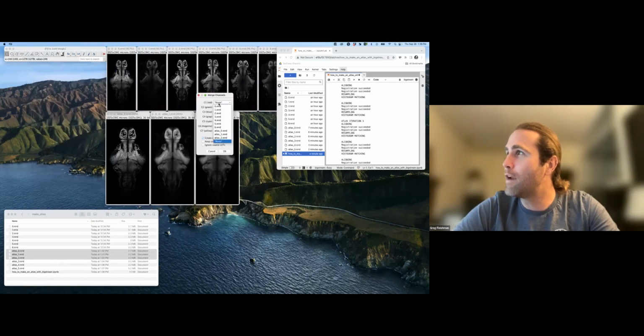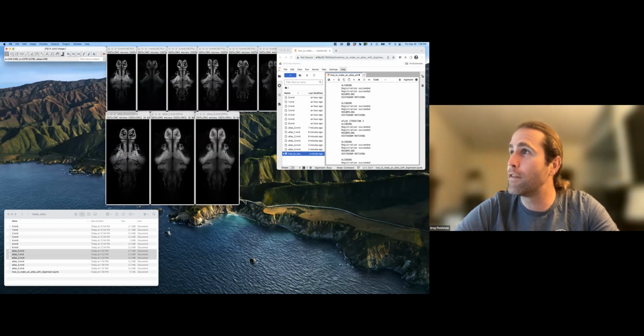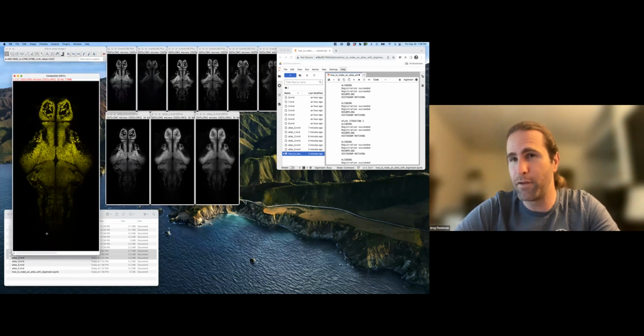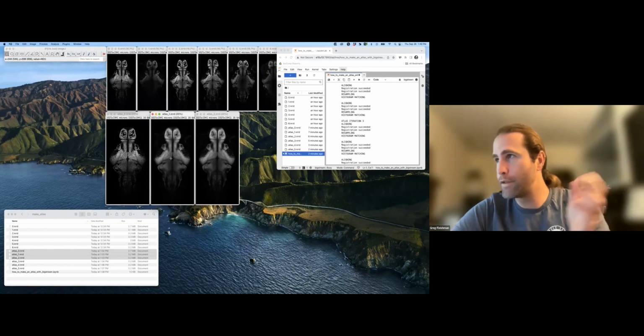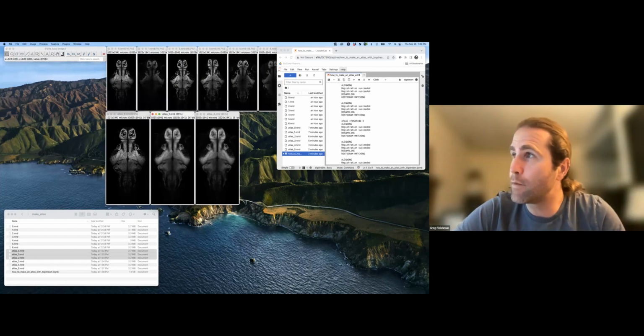But we're going to do it as a sanity check anyway, because I find that I am so prone to making silly mistakes when I do computational work that these obvious sanity checks sometimes do save me. But okay, the fact that it's all yellow is good. That means that image 0, which was in red, and Atlas 0, which was in green, are identical images. So now the next thing I want to do is put Atlas 1 on top of it. Let's just qualitatively look, there's already some differences between Atlas 1 and Atlas 0.